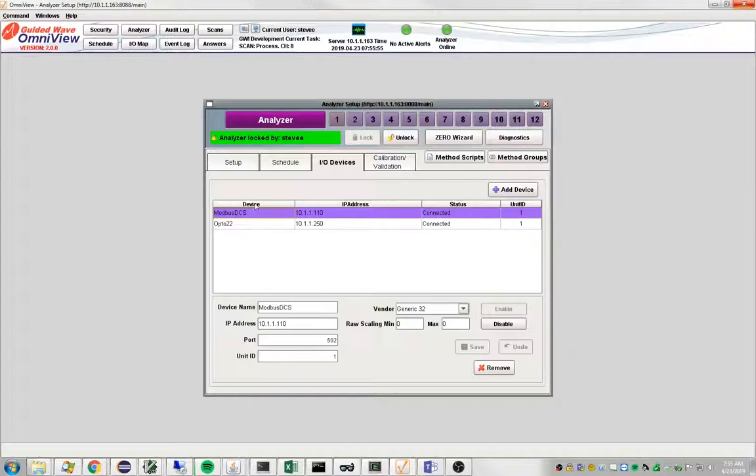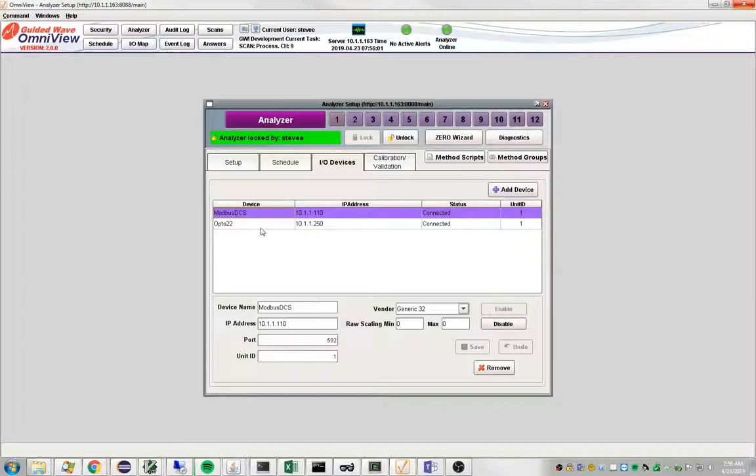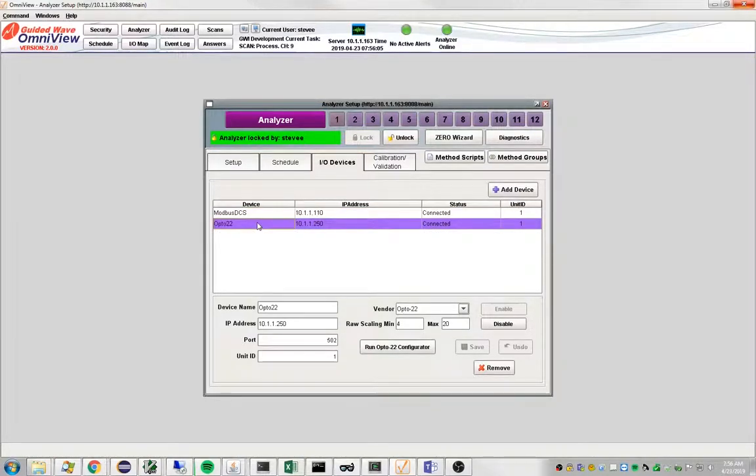How to create these will be shown in another video. But so let's just for now assume that I have these and that they are running and they are awaiting data from Omniview.